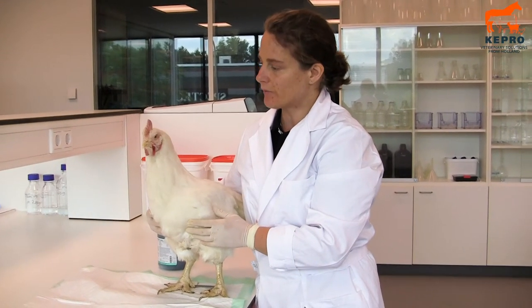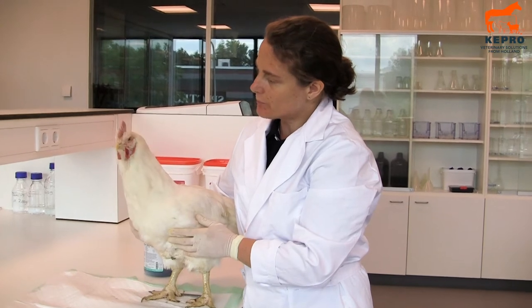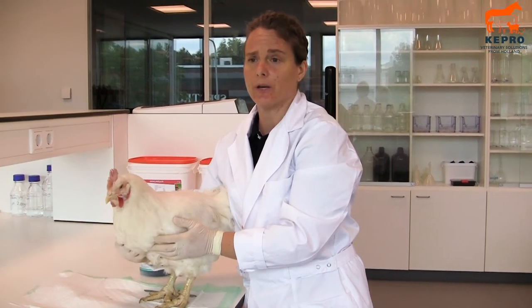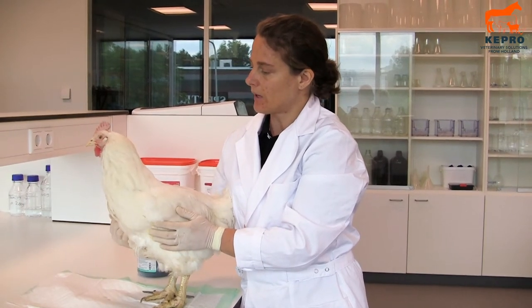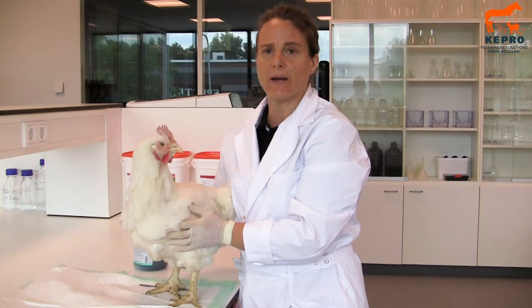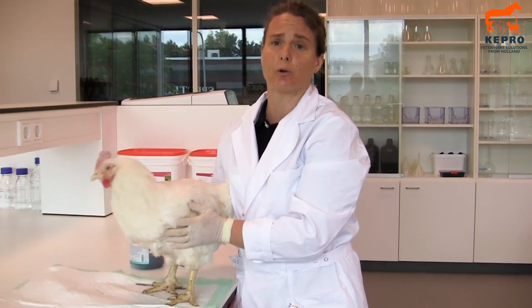This is the broiler breeder from the same flock we just saw the post-mortem from. These birds are very heavy, very big. These are Ross birds. They are in very good health and they are bred here in Holland. Now we will do the second post-mortem on this one to compare the guts and also to compare whether it makes a difference if you did a post-mortem on a chicken that has already been dead for a while or on a fresh one.